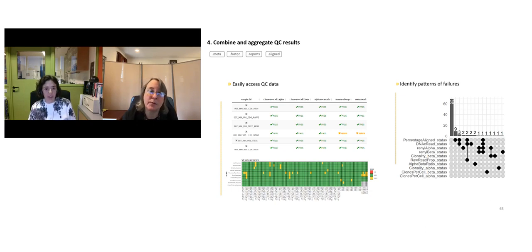So to conclude, that could be a nice way, and I think we encourage everyone to really think about getting all this information, the maximum information you can get out of your data, to identify potential issues that can be present from one run to another one, and then make your samples and your data not exploitable.